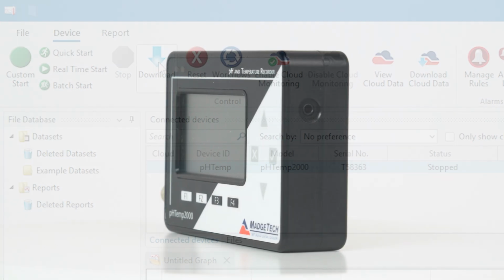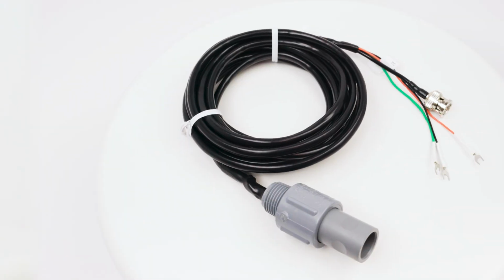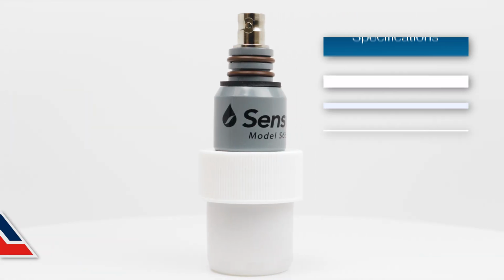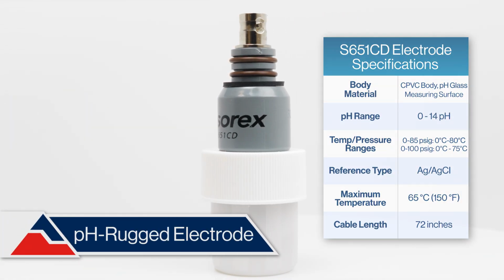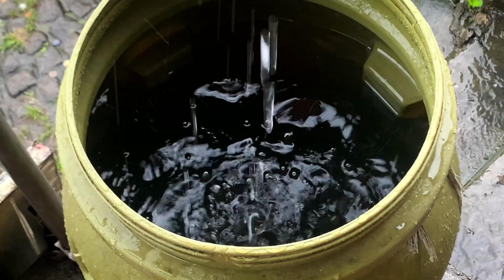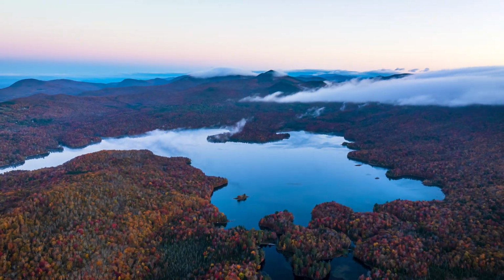Now that we've gone over some of the basics on how to start and run the pHTemp2000, let's look at some of the different connections available for the data logger. The pH rugged electrode is a submersible, CPVC enclosed pH sensor that's suited for use in outdoor applications such as monitoring drums, tanks, rivers, ponds, and lakes thanks to its rugged design.